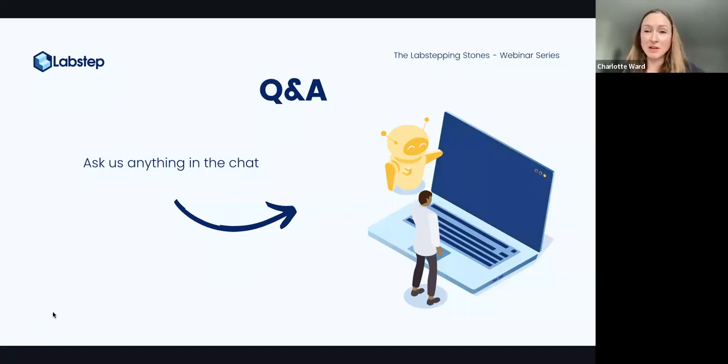Yeah, I mean, it's a big question. There's a lot that can be covered here, and I don't feel like I can do it much justice at the minute. But for sure, automation stretches across the whole area of R&D. So that's things like the planning of experiments, the actual execution, and also your data analysis and how you present that data. So there's lots of tools that stretch widely across that whole journey. To my knowledge, there's nothing that covers everything. Everything does some part of the journey or lots of the journey. But certainly things like Jupyter Notebooks can really help with those bits in between, where you've got really difficult parts in your process that would normally need quite a lot of manual intervention.